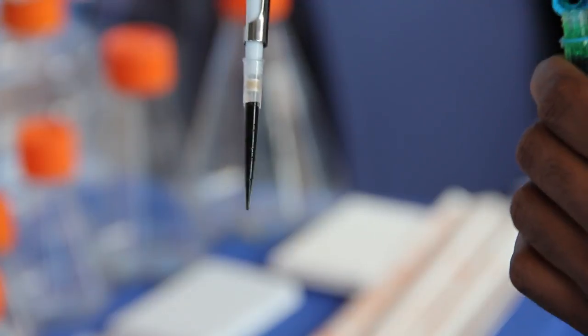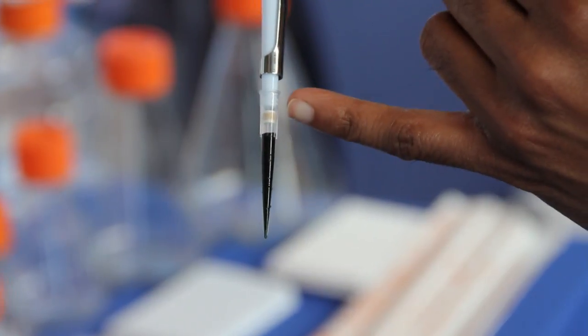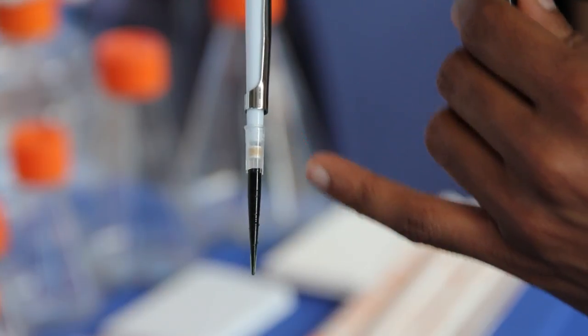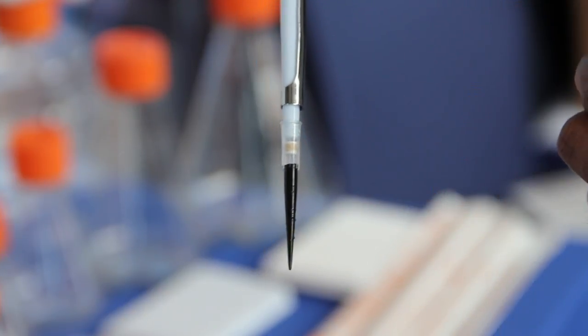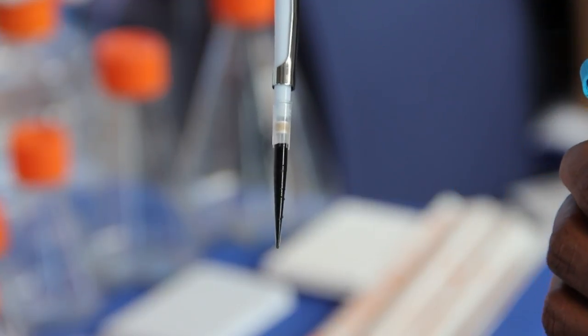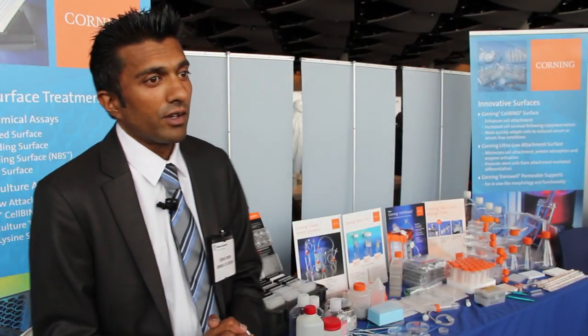These are the new Gen 3 filter tips. It has three different layers on the filter. These seal on impact, so as soon as you put that liquid up, it seals and you don't get any contamination or PCR inhibition. And we sell through Fisher Scientific all over the UK.